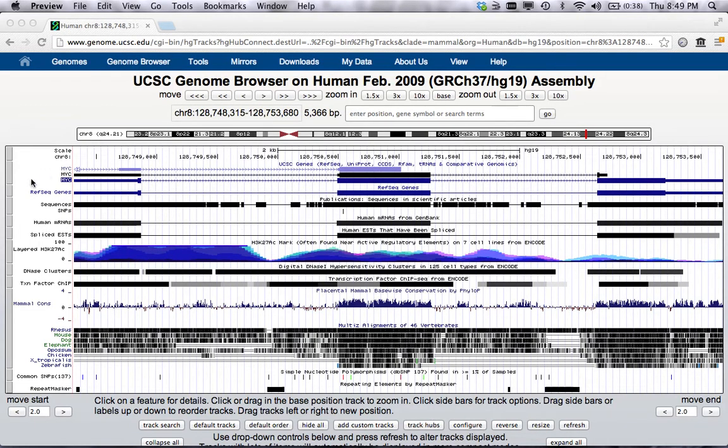So there's a brief explanation of the UCSC Genome Browser tracks in the assignment, but basically what you're seeing is a bunch of different columns layered on top of each other here that you can select individually to alter the depiction of the genome. So the first thing that we're going to do is just start deleting things off of here.